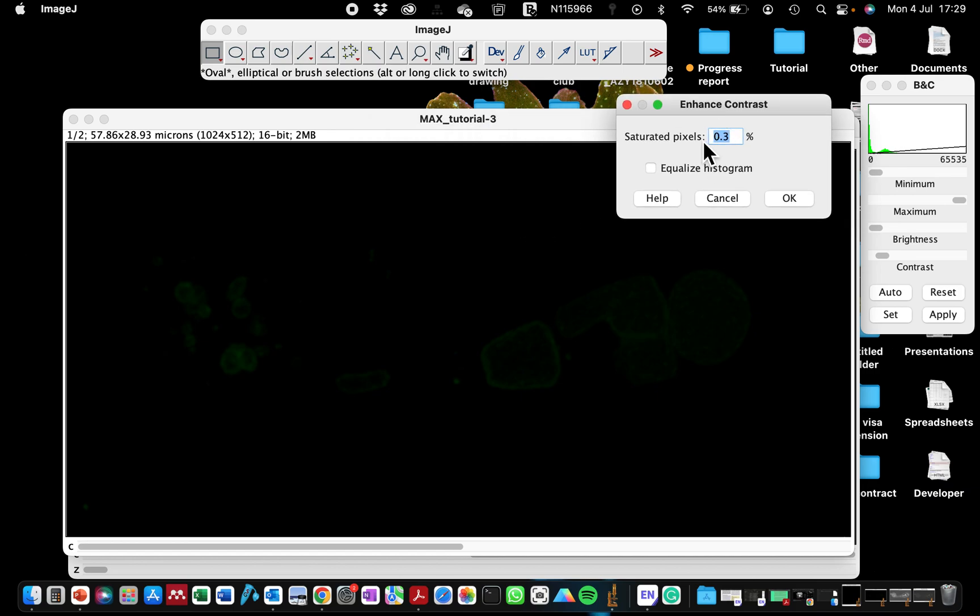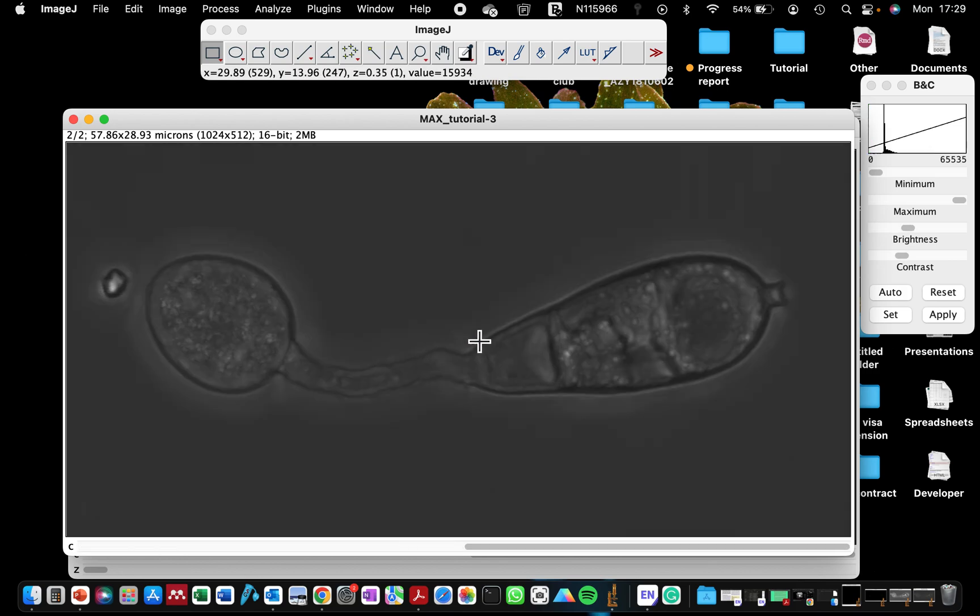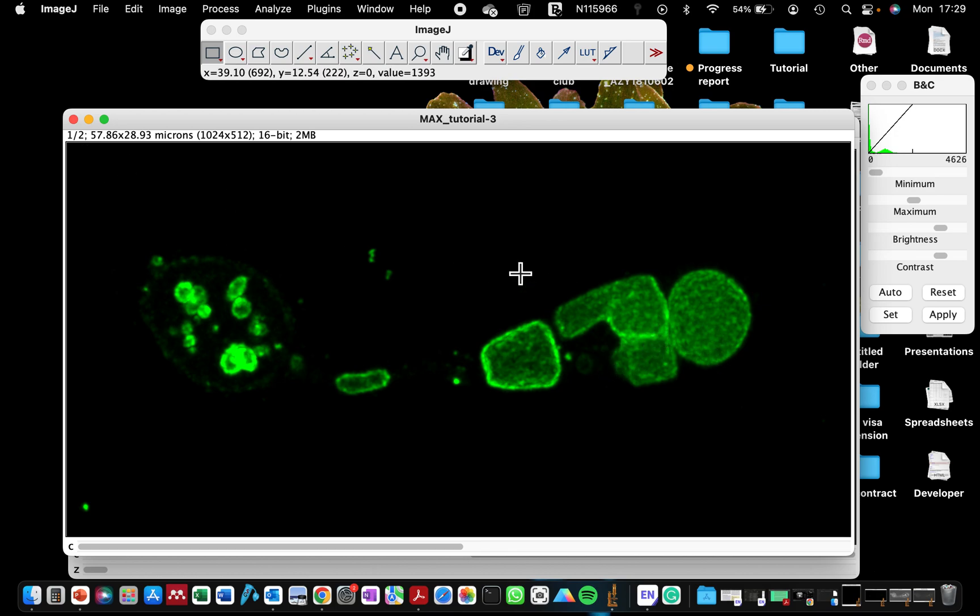It's going to show you that, okay, it can saturate the pixels by 0.3. And when you click on that, if you click on okay.